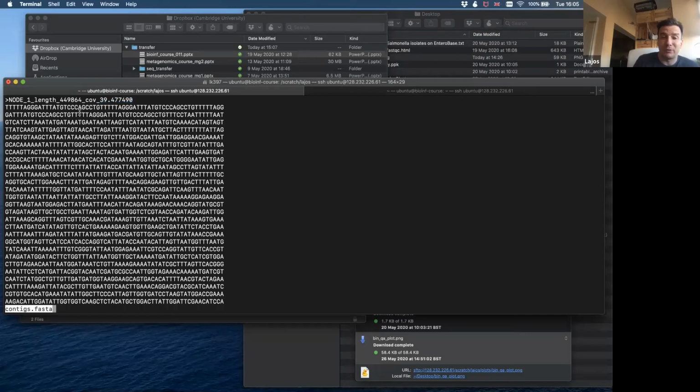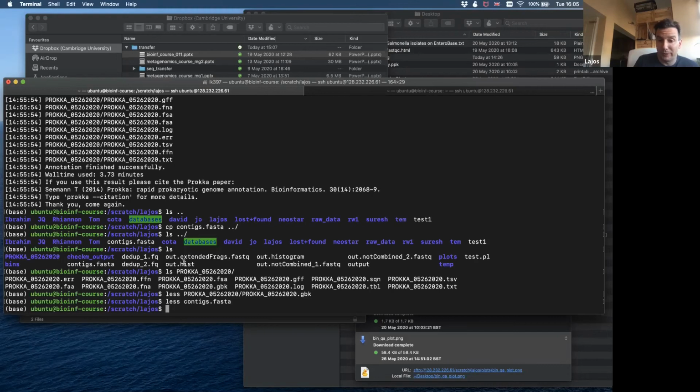So if you just write a short script, and again, I'm happy to write it together with you in R, you truncate all of them up to this point, for example, because this is also unique, as all the contigs are named differently. Then it will be GBK compatible. Of course, if you don't want to make it GBK compatible because you want to use another file format, one of the good file formats, which is much easier to handle, is the GFF, as far as I remember.